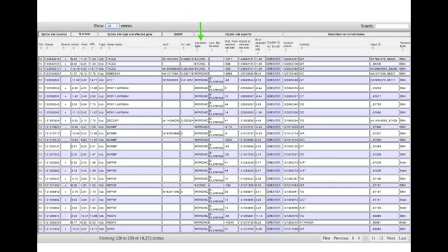A cryptic site in a gene can be found either within an exon or intron. If an indel spans an intron-exon boundary, it is classified as exonic. If a cryptic site is intronic, its location relative to the nearest exon is reported. If a cryptic site is downstream of an exon, it is 3' flanking, otherwise it is 5' flanking. The next two columns report the number of base pairs separating the cryptic site and the nearest natural site, as well as the coordinate of the natural site.